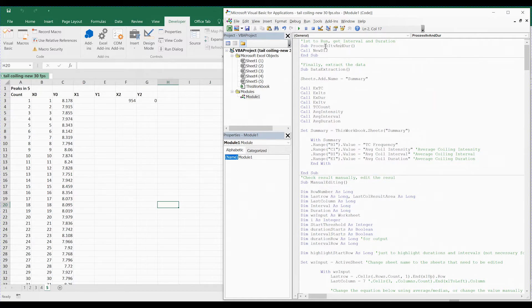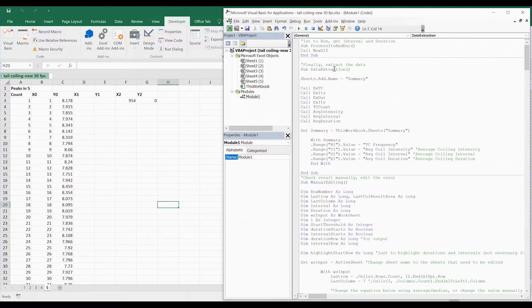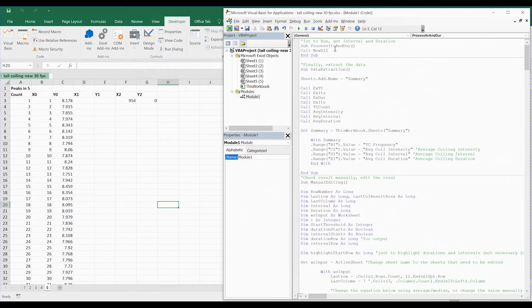We have three main macros as provided in the SOP. The first one is ProcessItvAndDur for obtaining the interval and duration. Next is Manual Editing for manually editing data that have errors. And next is Data Extraction to get the final summary of the data.